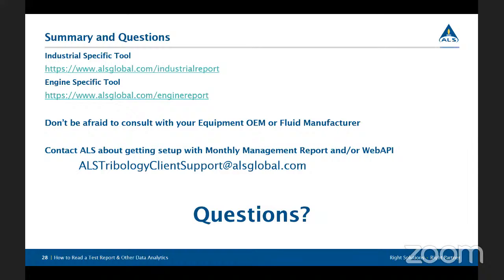Last question, Robert. In the reports, are the diagnostics tailored for each sample, or is there a standard reply based on results? Good question, Robert. Sometimes it might feel to you that there's a standard reply. We do that for efficiency reasons on our end. Many times, as a diagnostician, I review hundreds of reports a day. I would take my time on them, but for the sake of time, we use special codes that allow me not to have to hand type out hundreds and hundreds of words.